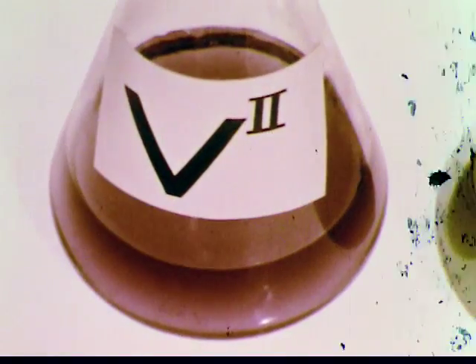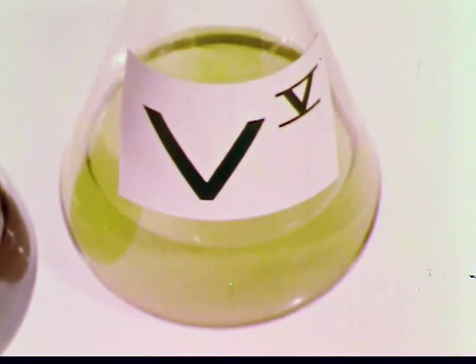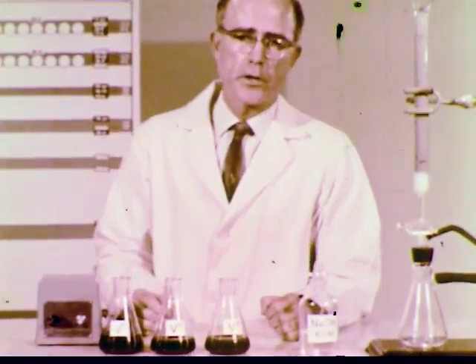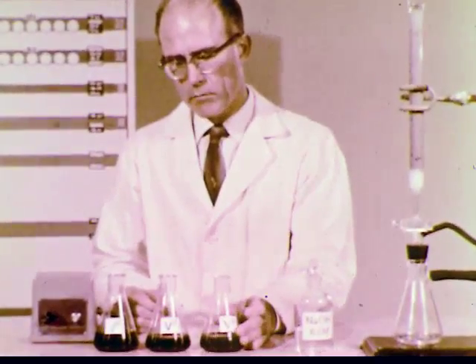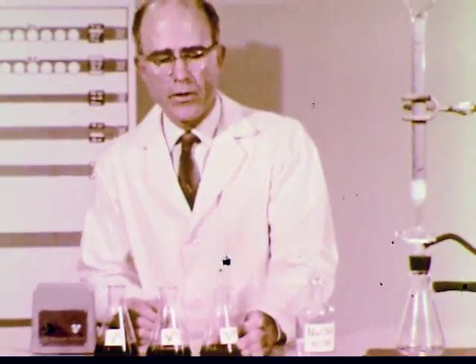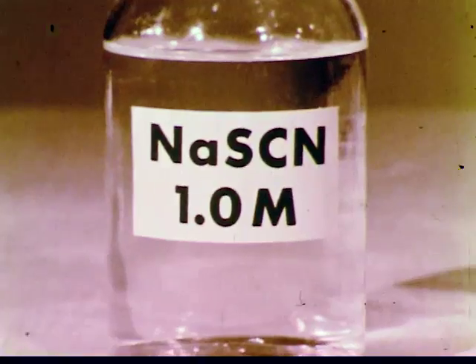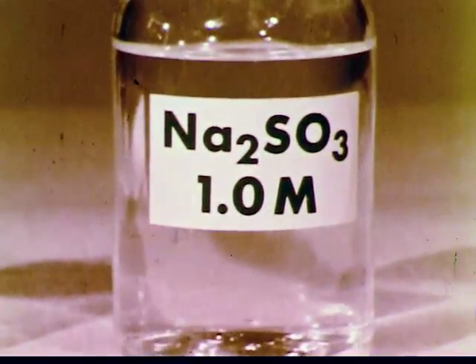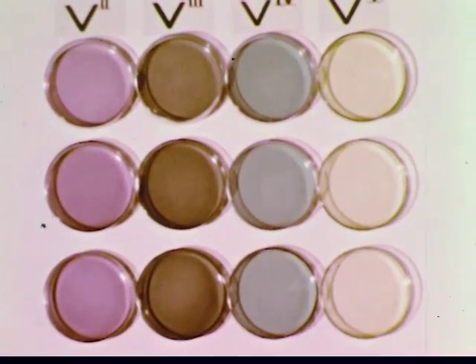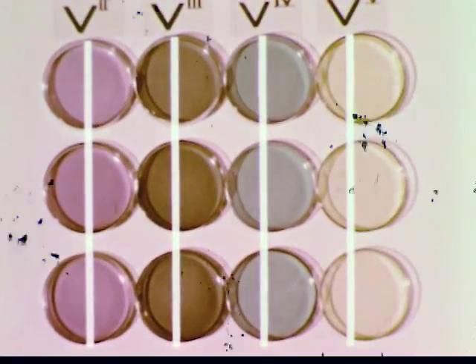After the film, you might like to discuss how vanadium 2 and vanadium 5 would react with sodium hydroxide. So far, we have only concerned ourselves with the chemistry of vanadium in the presence of water molecules and the hydroxide ion. Now let's study the chemistry of some of the vanadium ions in the presence of other negatively charged ions, such as thiocyanate and sulfite. Here are samples of vanadium in its 4 oxidation states: vanadium 2, 3, 4, and 5.